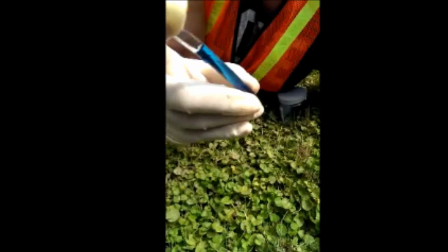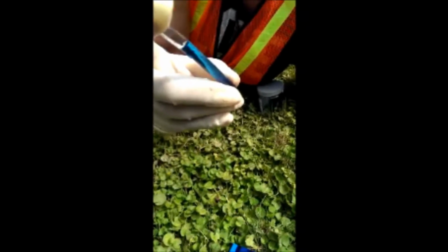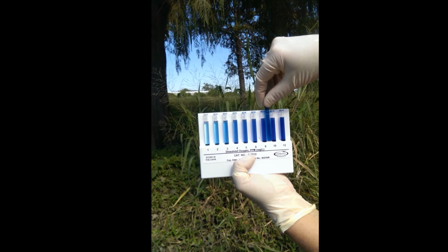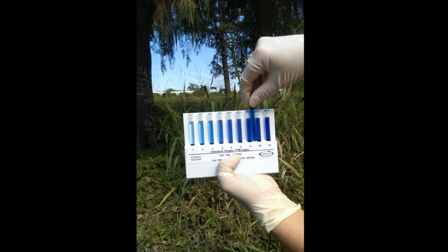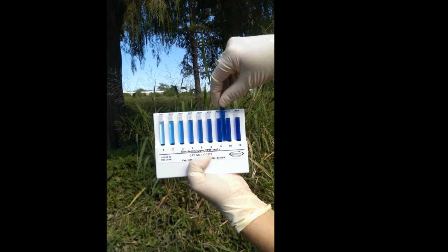Cap the end of the broken vial with your finger and then invert several times to mix together. Using the scale provided by the Chem Met kit, measure the dissolved oxygen content. It is important to take a larger sample to monitor the dissolved oxygen content after an extended period of time.